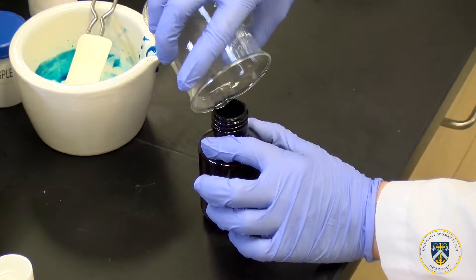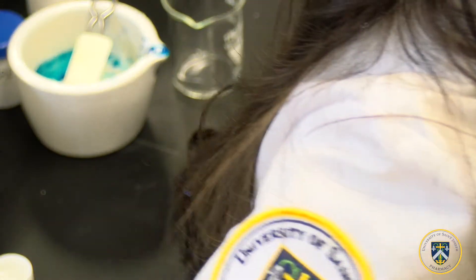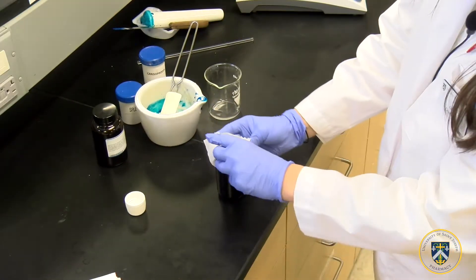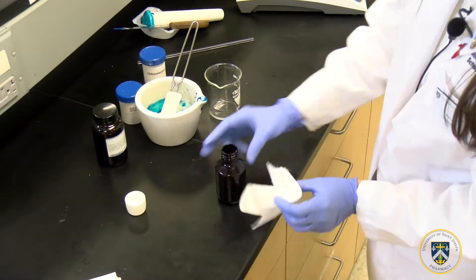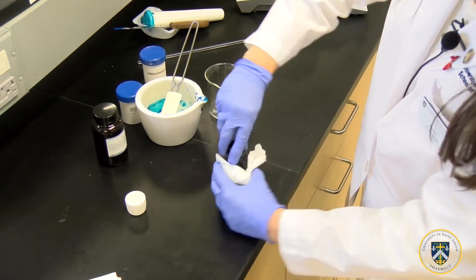Once all the methyl cellulose gel has been transferred to the amber vial, you may need to use a paper towel to wipe down the edges so that your label will be able to stick.